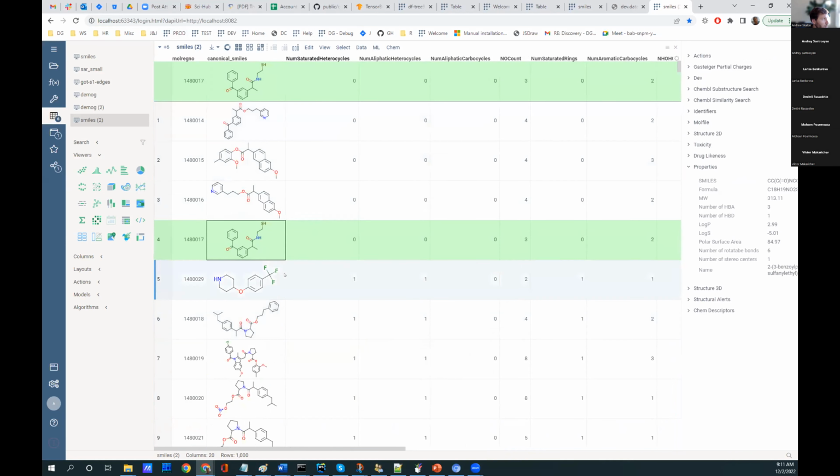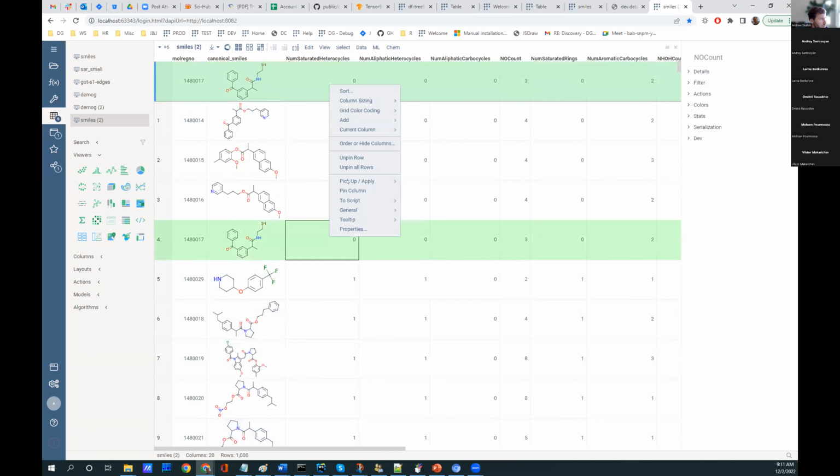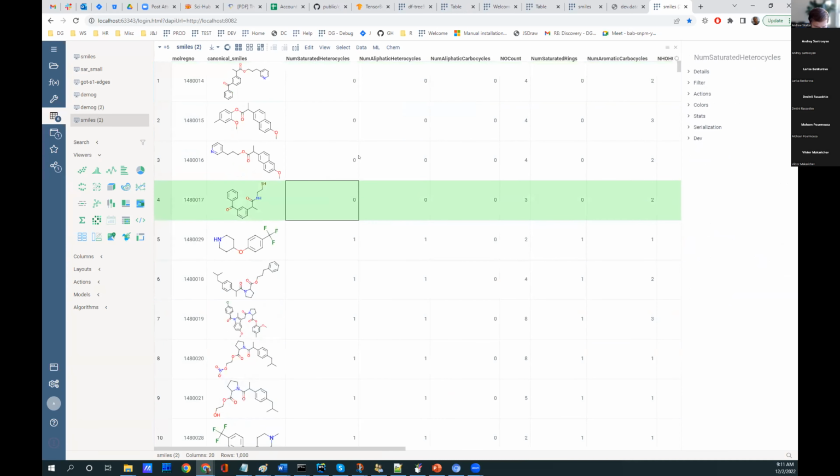Yeah, what's cool is that you can sort, and of course it will stay on top no matter how it's sorted. It's pretty convenient when you work with collections where you have some reference compounds or reference anything. Frankly, I would still prefer the index to be shown so that you know which row is actually pinned. Could be, yeah. We might do it, Dima. Thanks.